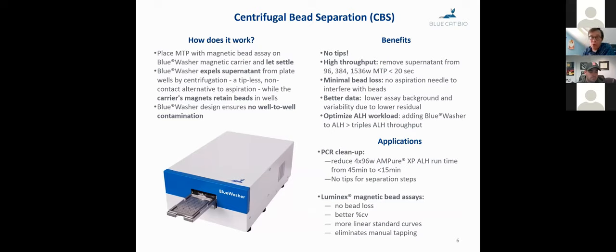So, how does it work? We call it centrifugal bead evacuation. It's pretty simple. You place your microtiter plate with your magnetic bead assay on one of our magnetic carriers. You see one of the magnetic carriers situated here on the blue washer's nest. Then you start it, and after the beads settle, the centrifugal motion expels the supernatant, and the magnetic carrier retains the beads, and all of this works with no cross-contamination. So, this works with no tips in high throughput, minimal bead loss.